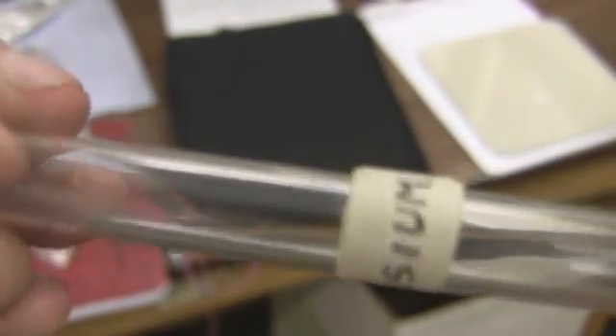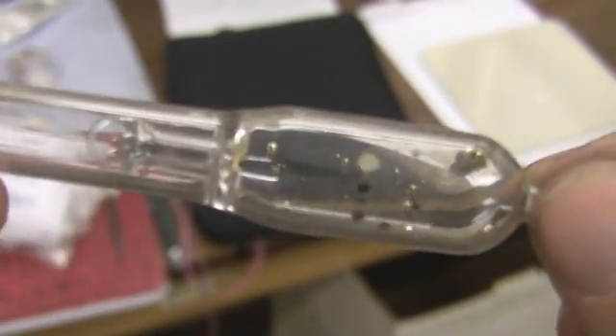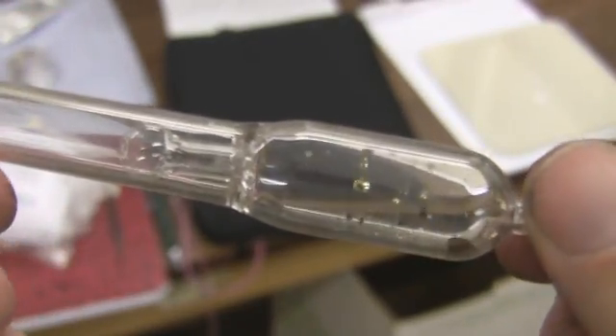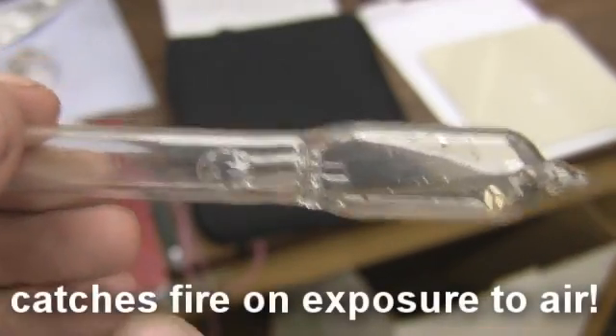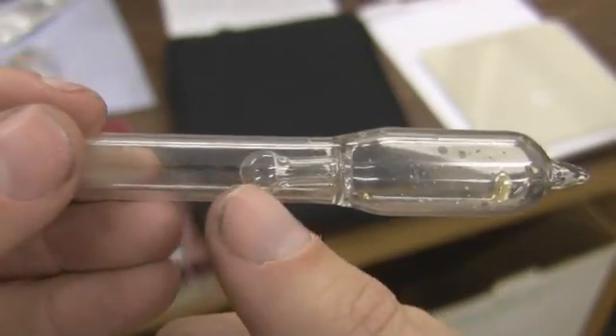This is cesium, which is basically the most reactive of the metals. This wouldn't survive very long at all in an oxygen atmosphere, which is why it's actually sealed in a glass. This is under complete vacuum in here, and this thing's called a brake seal.